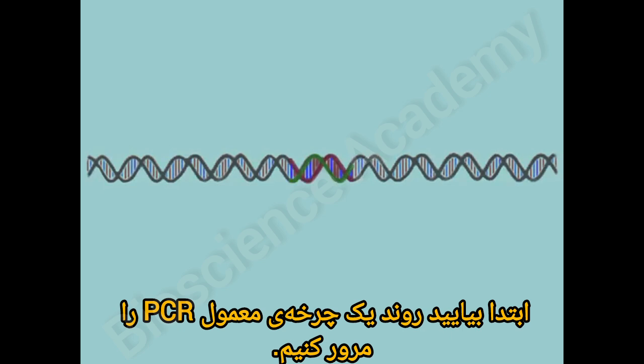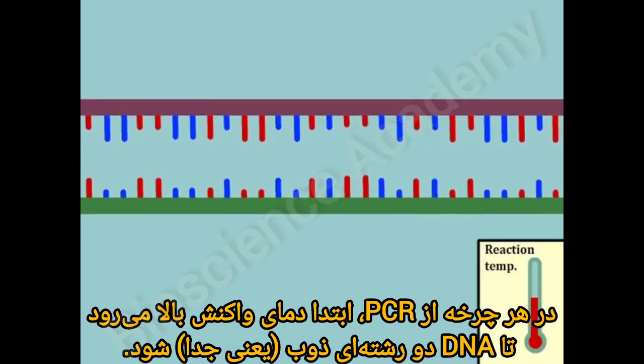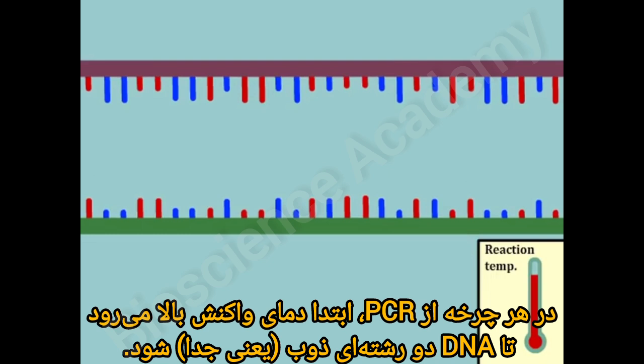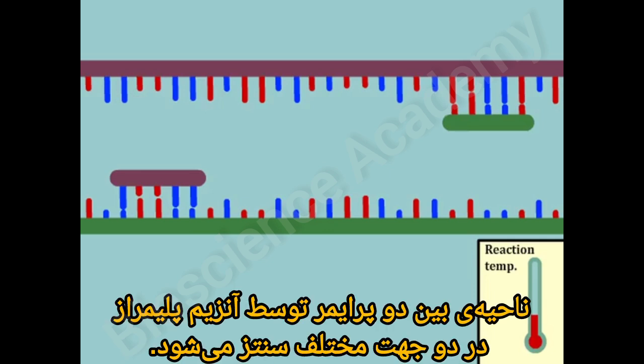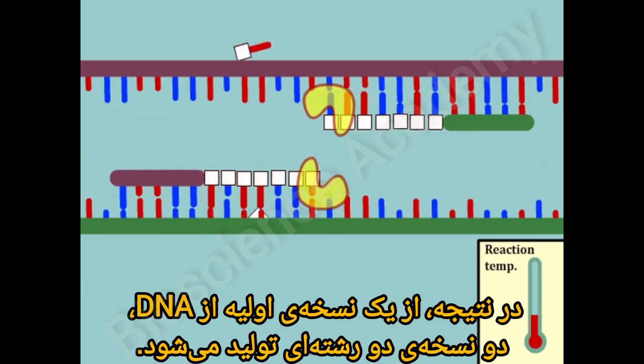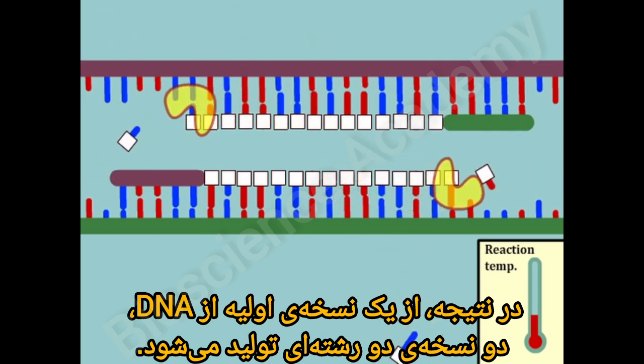To understand how amplified PCR products, also called amplicons, are detected in real time, let's first review the events that occur during a normal cycle of the PCR reaction. Recall that the first step in any PCR cycle is to raise the reaction temperature and melt double-stranded DNA. Then, when the temperature is lowered, the specific primers bind to the sequences at each end of the target DNA. The intervening DNA can then be synthesized by polymerase reaction in opposite directions. As a result, you produce two double-strand copies of the target DNA when you started with only one.